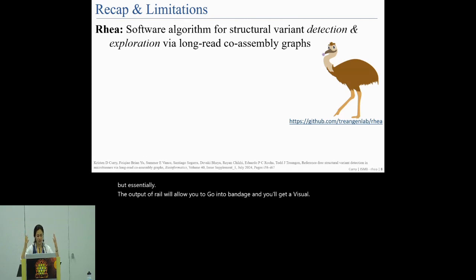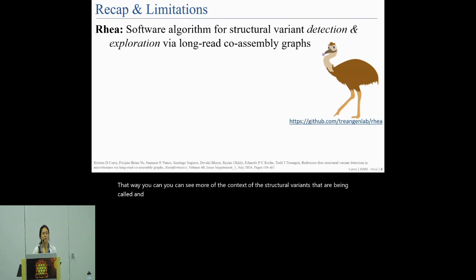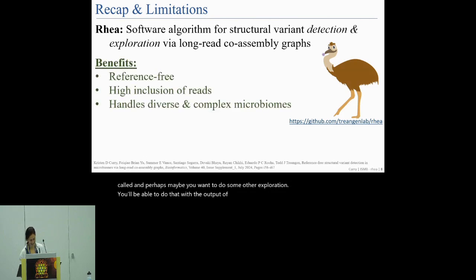That way you can see more of the context of the structural variants that are being called, and perhaps you want to do some other exploration. You'll be able to do that with the output of Rhea.